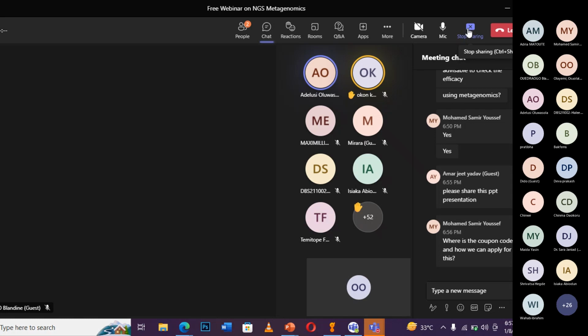You can narrow down your research at the taxonomy classification, at the community, the biodiversity aspect of the work. You can narrow down your research to a specific organism you are looking for at the species level. And when you are doing AMR analysis, like resistance genes and virulence factors, you can actually know which genes are associated with the specific organisms you are interested in.